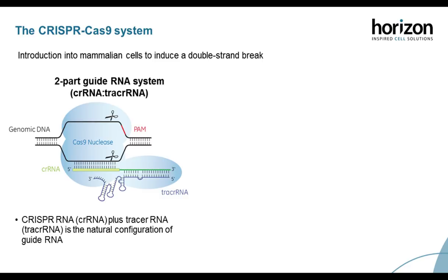Generally speaking, the adaptation of CRISPR-Cas9 has two forms. The first system that we see is on the left, and this has the Cas9 nuclease displayed in blue. This acts as a scissors to cut the DNA, and the Cas9 protein is in complex with two small RNAs: the CRISPR RNA, often shortened to crRNA, displayed in yellow, and the tracrRNA in purple. These small RNAs guide the Cas9 nuclease to a specific locus within the genome so the Cas9 can make the desired cut.